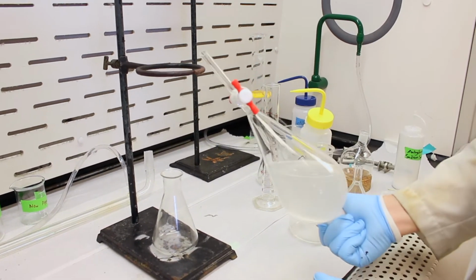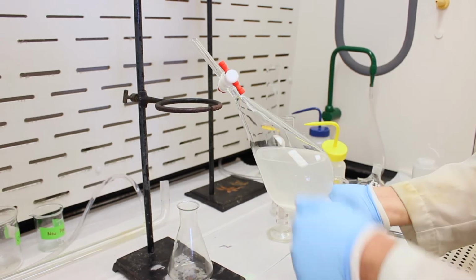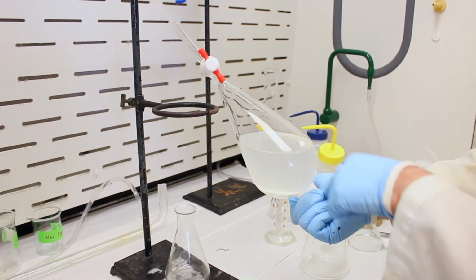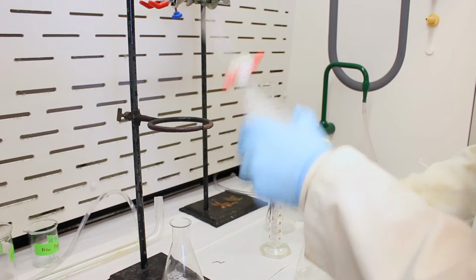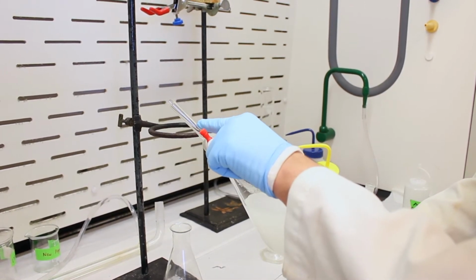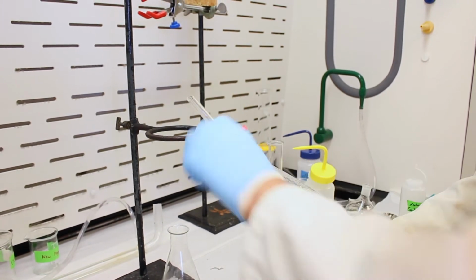It's important to vent the separatory funnel because when you shake it, there's going to be a lot of pressure built up, and you need to relieve that pressure. Sometimes if there's too much pressure, the solvent could leak from the joint up here, or from the stopcock. So we'll close it and shake and vent. So we'll shake it and vent. You just heard a lot of pressure build up. We'll do it again. And vent. We'll do it a 3rd time.